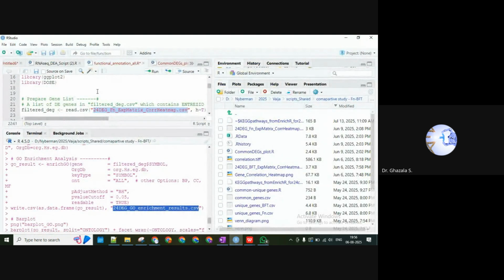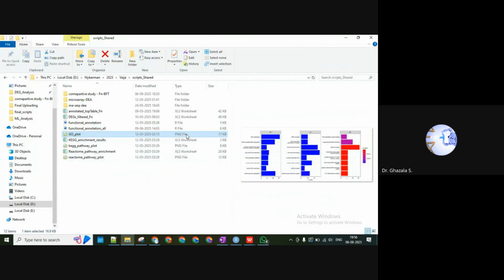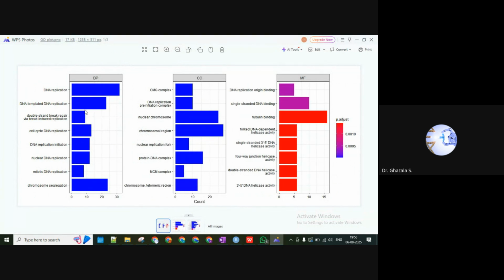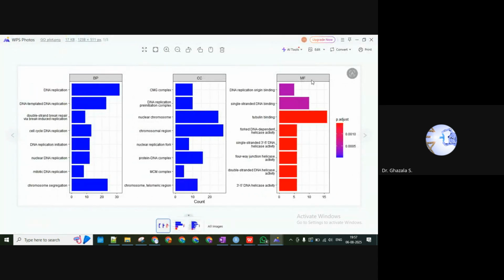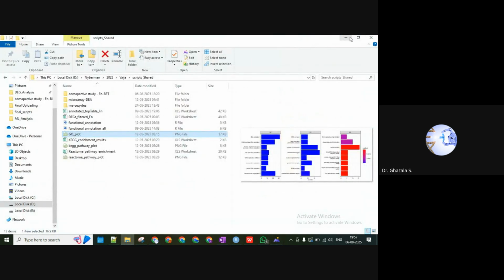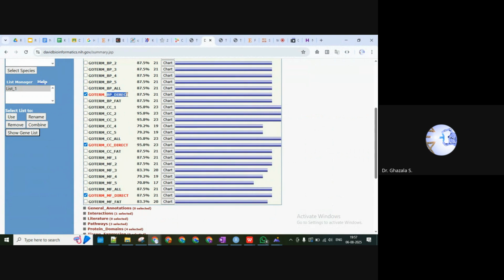I shared the R script with you where we are doing functional annotation, and for the same thing, we are getting the results. So these results which we got are not from Enrichr. The same thing we are doing now in DAVID. You just need to download the tabular data and generate these figures. We already used the tool and generated these figures. So you don't need to do DAVID annotation again because you already have biological process, cellular component and all. But still, if you want to see how to do functional annotation with DAVID, let's proceed. First we will check for biological processes where your genes are involved.